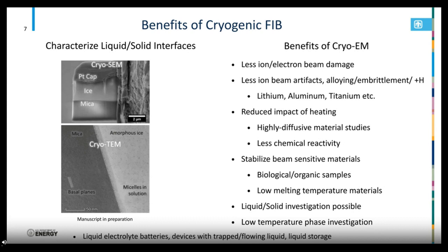And here's an example of some of my work where I looked at a surfactant solution against a mica substrate, looking at how the surfactant solution behaves at that substrate. These are great especially for modern batteries that have liquid solvents, liquid electrolytes, other devices with trapped or flowing liquid, as well as liquid storage.